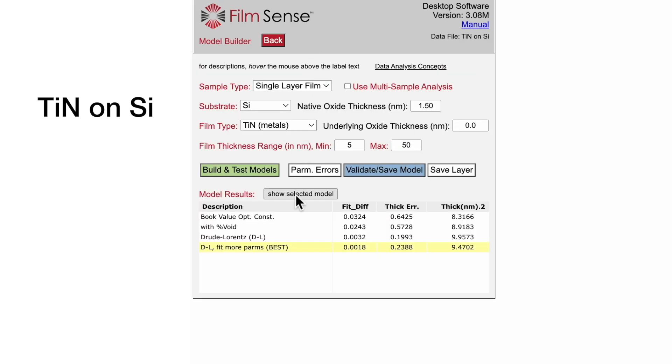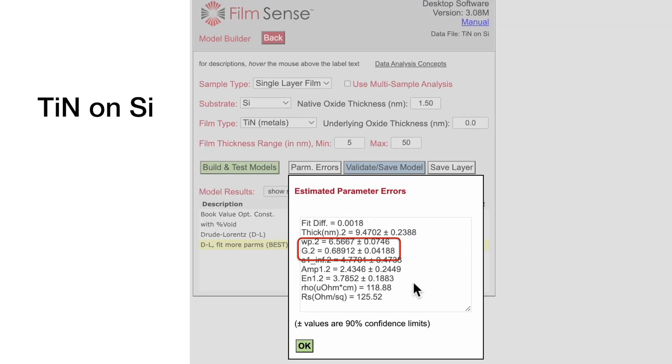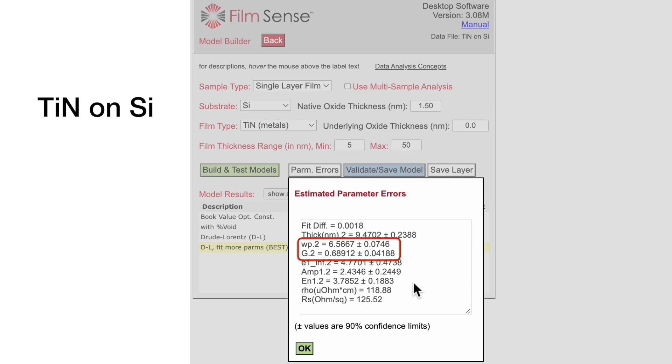As was the case with the ITO film, the Drude parameters can be used to calculate the film resistivity and sheet resistance of the metallic titanium nitride film.